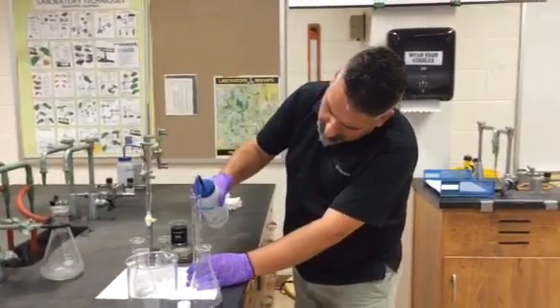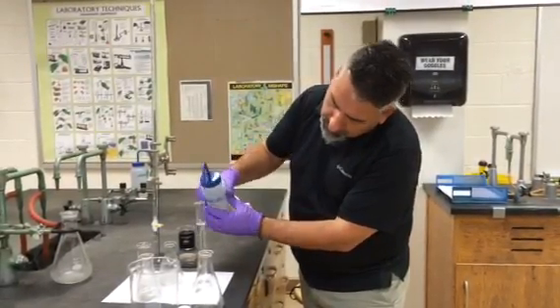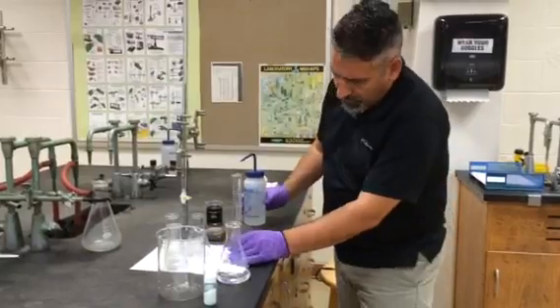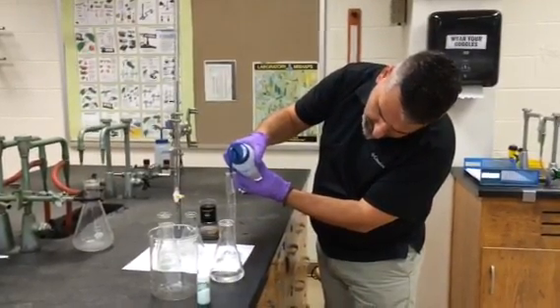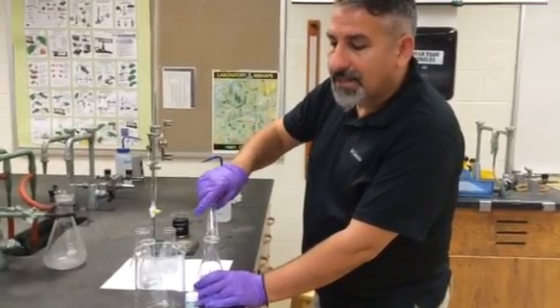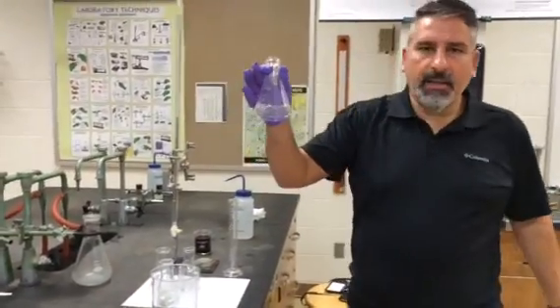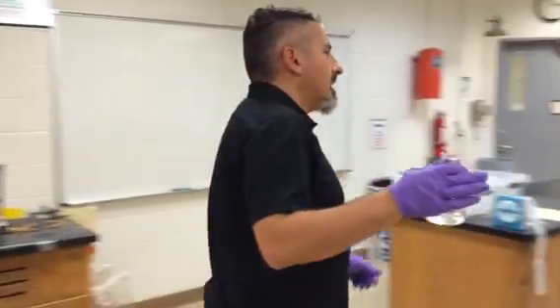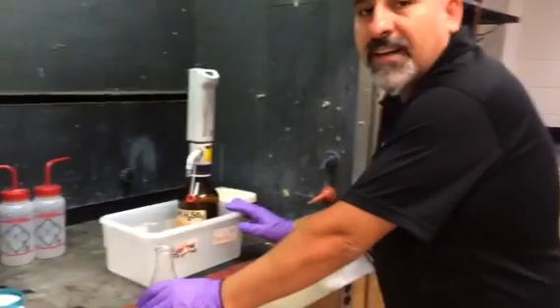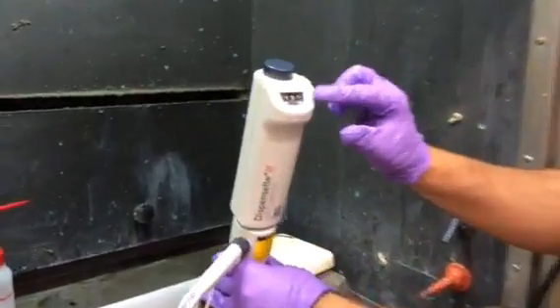I take the water — 62.5 mL — and I'm going to come to the hood to take the sulfuric acid. Students need to be very careful with the sulfuric acid because they may burn themselves. Here it is, adjusted at 12.5 milliliters. They don't have to do anything to it.